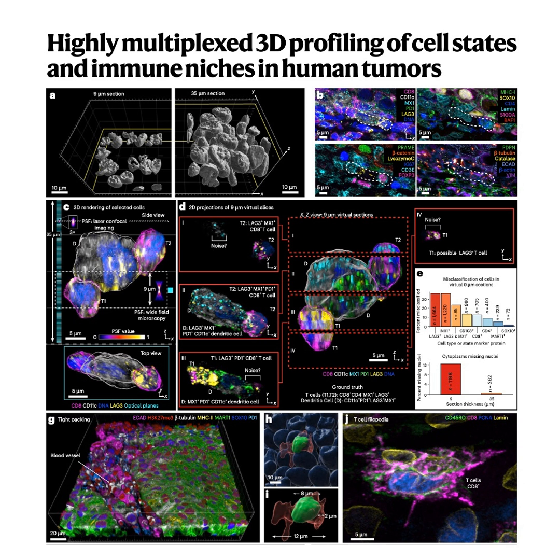This is where that nanoscale resolution really becomes critical. The precision allows them to move beyond just saying cells are near each other to actually detecting functional contacts, often visible as specialized structures or protein clusters right at the membrane interface. A key example is juxtacrine signaling complexes. Remember, juxtacrine means signaling that requires direct physical touch between cells. They looked at the immune receptor PD-1 on T cells and its ligand PD-L1, often found in tumor cells or other immune cells, which acts as a brake on the T cell response.